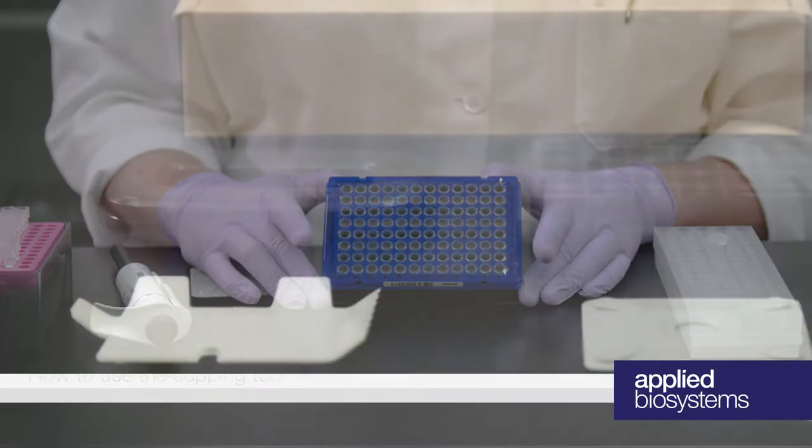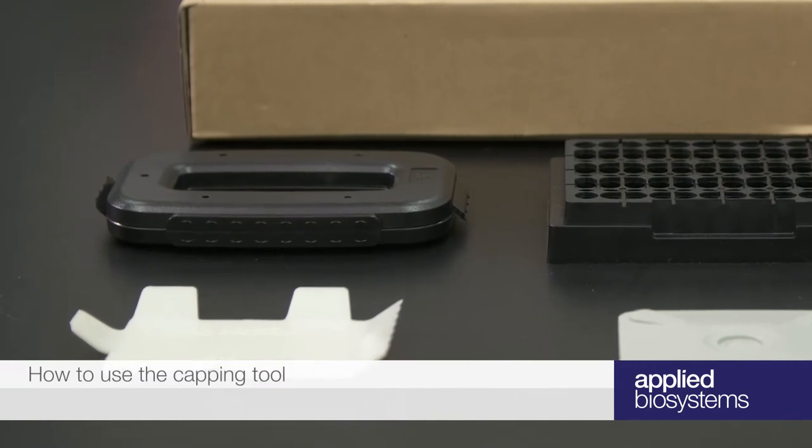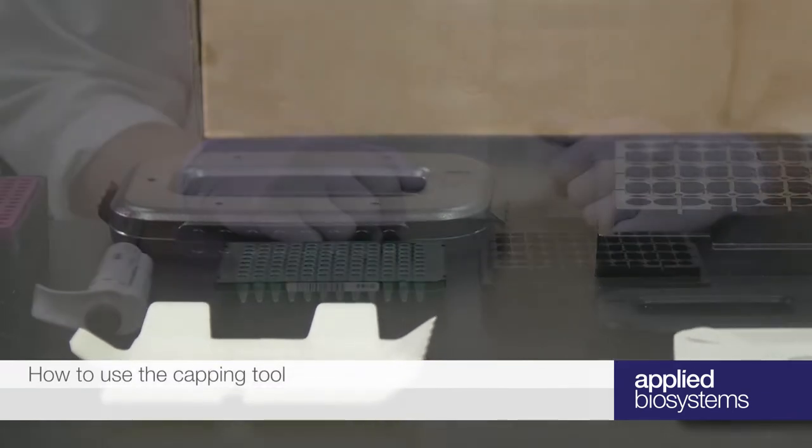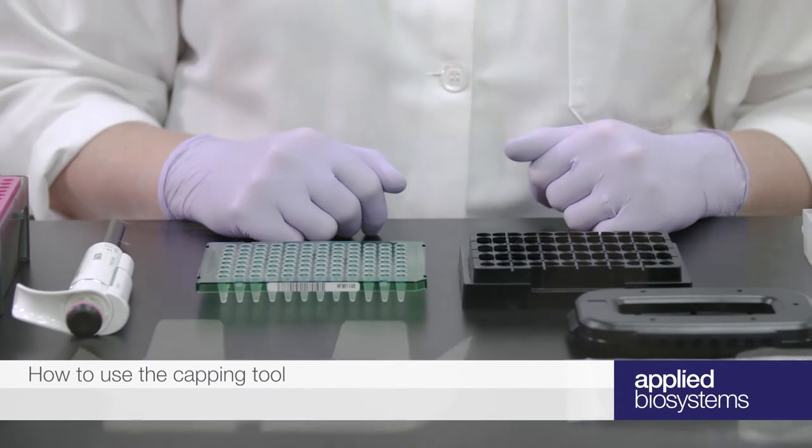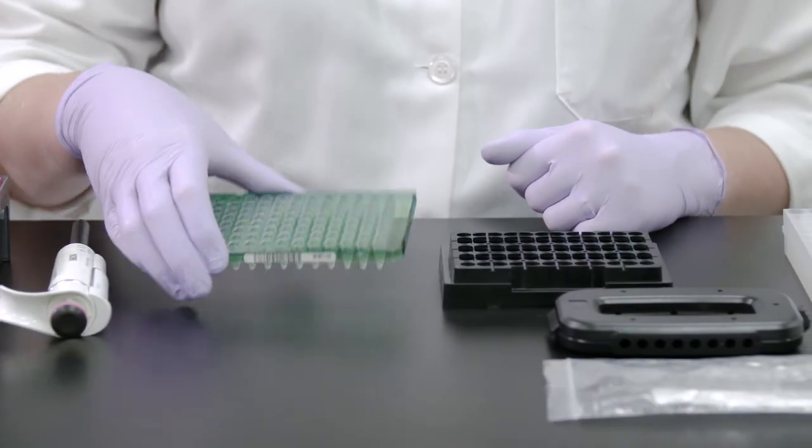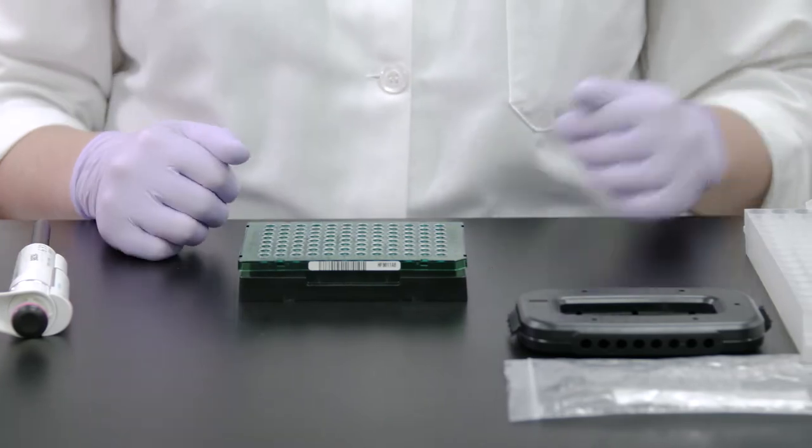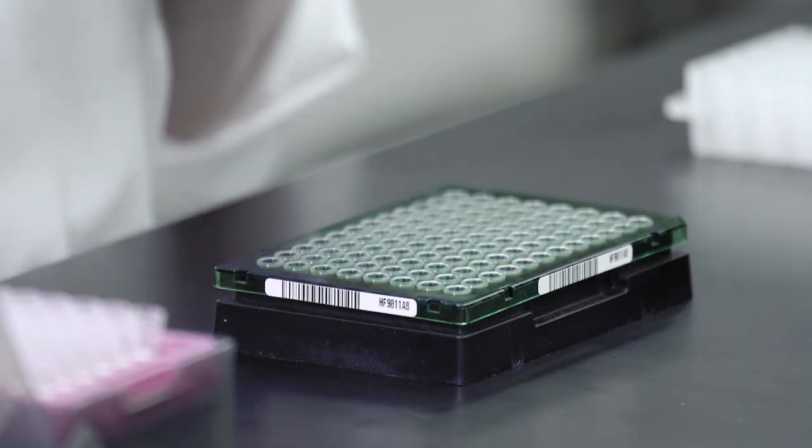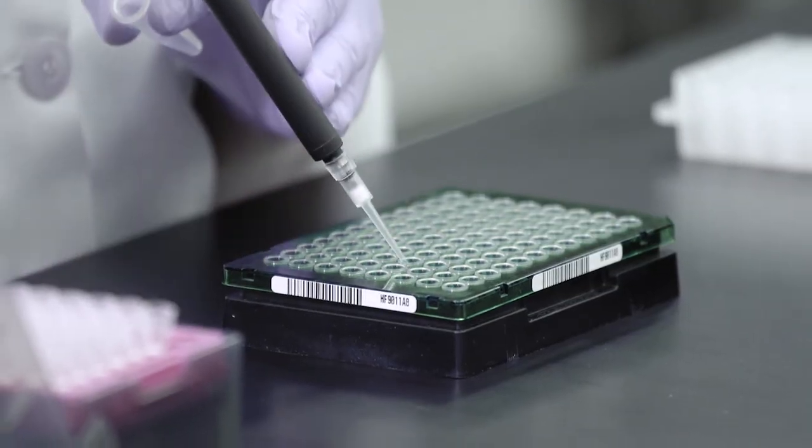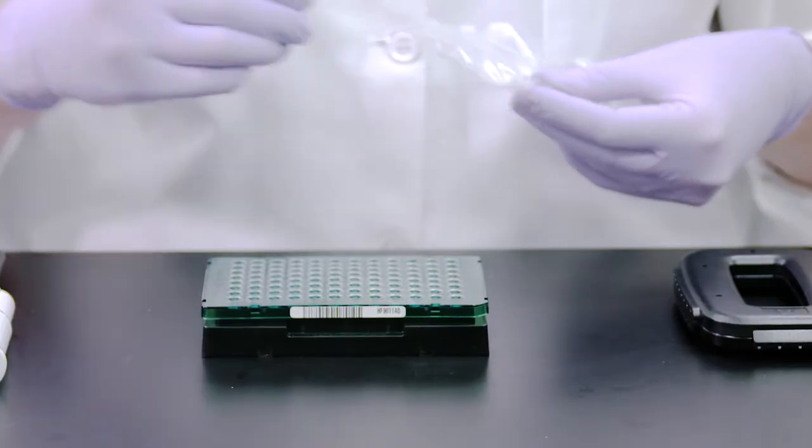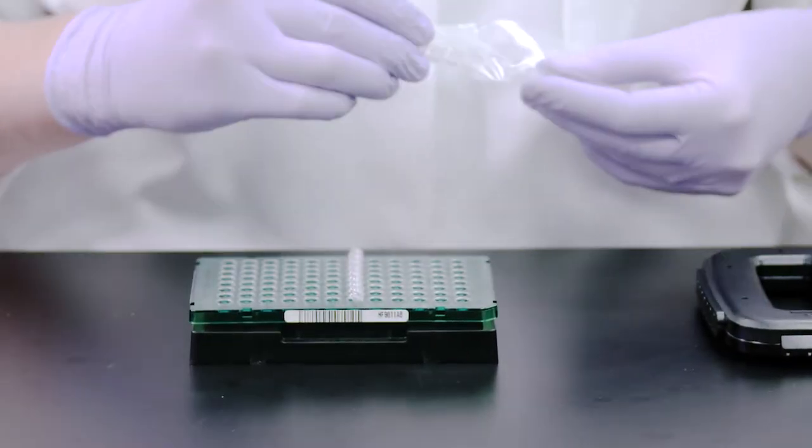Use of the capping tool makes it easy to securely seal a plate when using cap strips. To seal your plate using cap strips, first place your plate securely in the PCR plate rack. After pipetting your PCR samples, remove the cap strip from the packaging and align the cap strip to the designated wells.